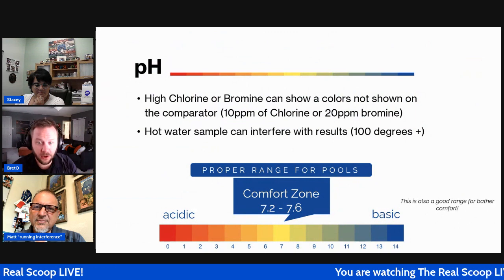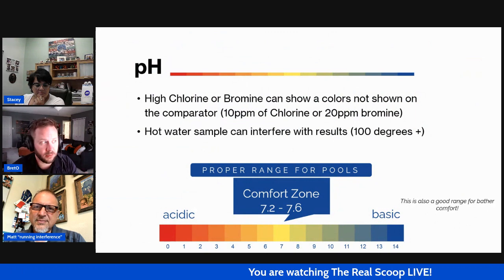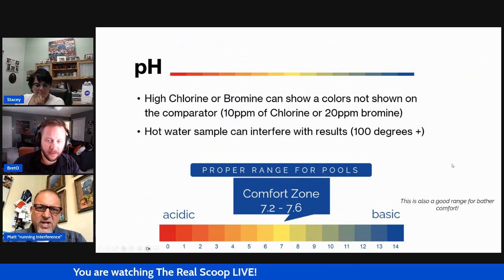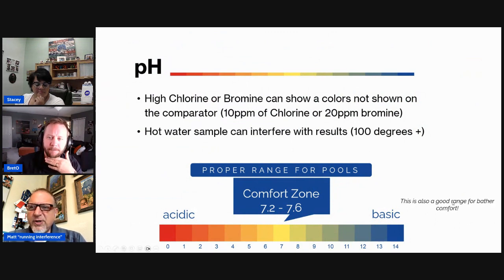So we'll actually talk more about temperature on a further slide down, but just know that that can affect this one as well. There's two more parts to that too before we go on to the next one, and that is when you have a water sample that's rip roaring hot, you may be, and most likely will be, having the chlorine burn out as well. If something was really hot, even if it came down to room temperature, it may register that the chlorine is 0 when really it could be 3, 5, or 10. We just don't really know.